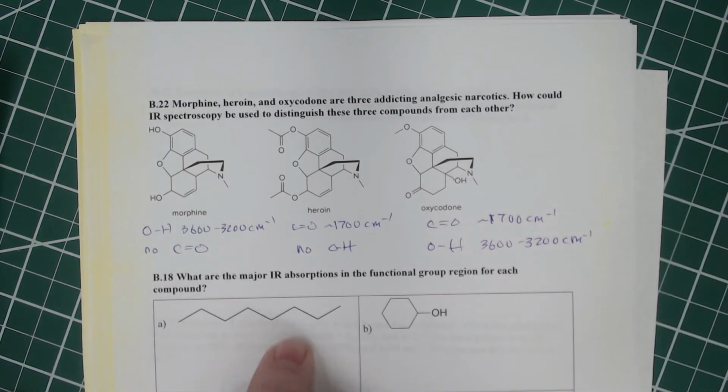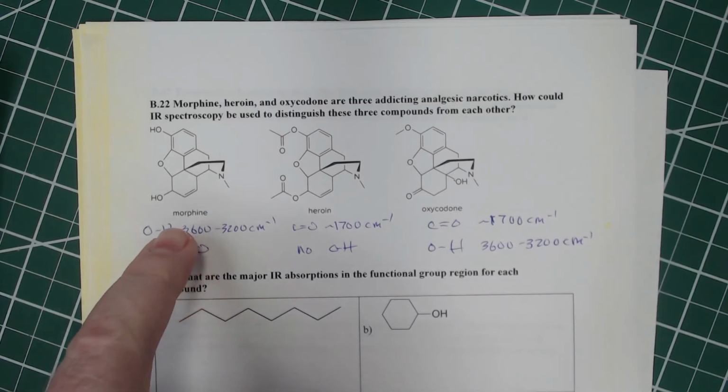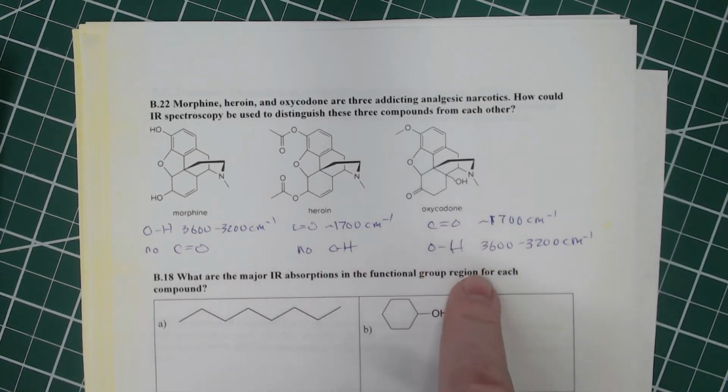So we should be able to very quickly, if we took quick spectra of these, distinguish between morphine, which has the OH but no carbonyl, heroin, which has the carbonyl but no OH, and oxycodone, which has both a carbonyl and an OH.